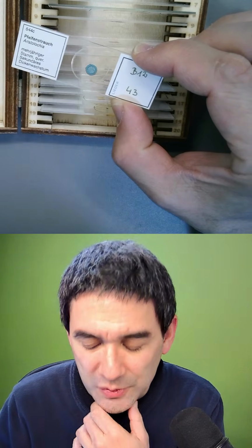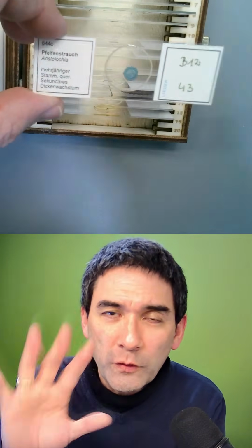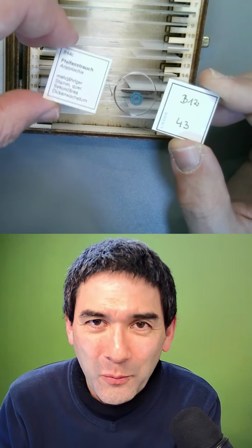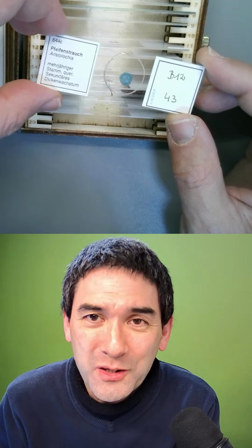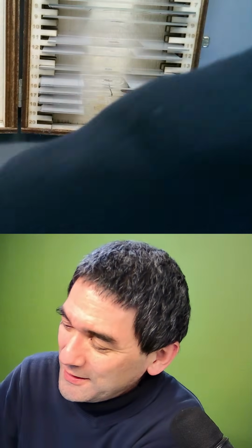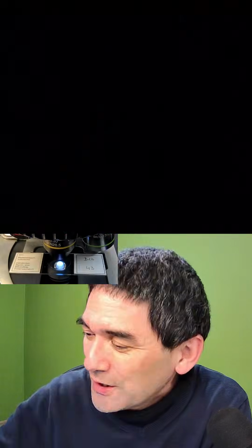This was actually one of my first slides, where I have taken, I kid you not, a few hundred overlapping pictures using my homemade webcam microscope camera. And then I manually stitched them together at that time into a larger image. I just want to show it to you because I think it's pretty nice looking, and that's why I chose this one to make those. But it's a fairly large specimen, and for this reason I'm not able to fit everything on here. So let's go down again and look at this.